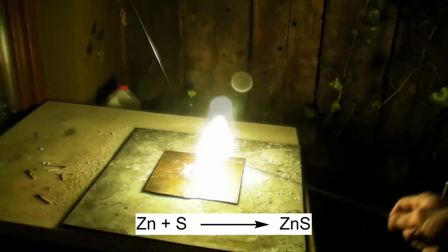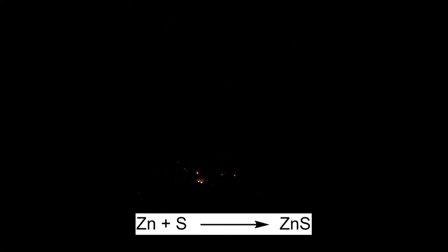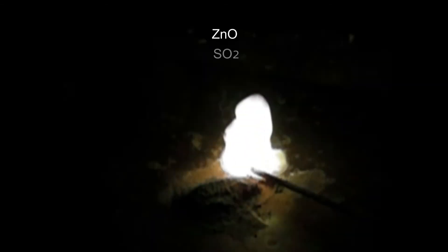In an exothermic reaction, zinc and sulfur react to form zinc sulfide. Nevertheless, zinc oxide and sulfur dioxide are also formed. There is often a delay before the mixture ignites. It is also possible that the sulfur ignites at first and burns for a few seconds until the expected reaction takes place.